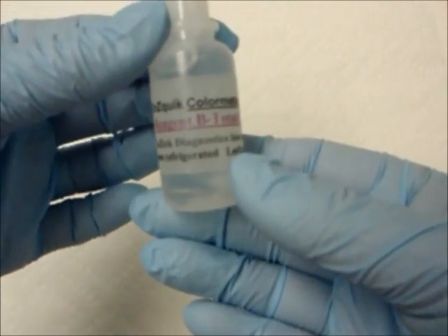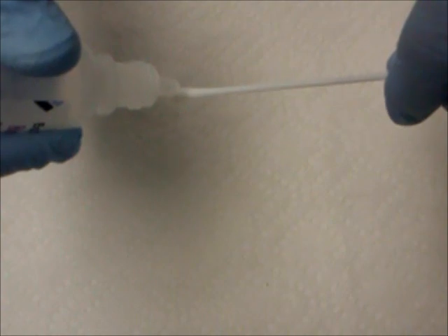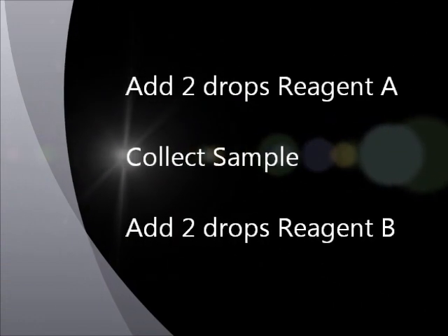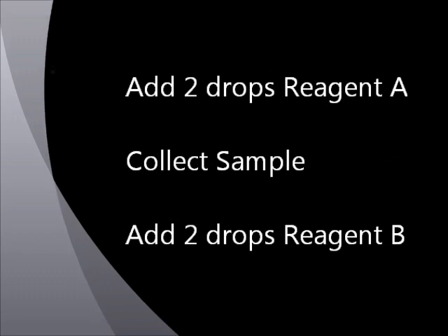As soon as the sample is collected, immediately add two drops of reagent B, which contains the chemical solution that will recognize the bacterial cells if present. Affix the swab to a clipboard with the swab tip placed over the edge and a paper towel placed under the swab tip. Continue to collect as many swab samples as desired by performing the same steps of adding two drops of reagent A, collecting your sample by rubbing the swab on the surface to be tested, and adding two drops of reagent B.